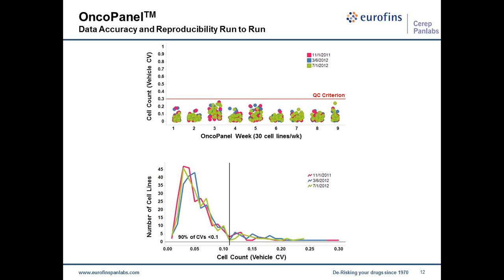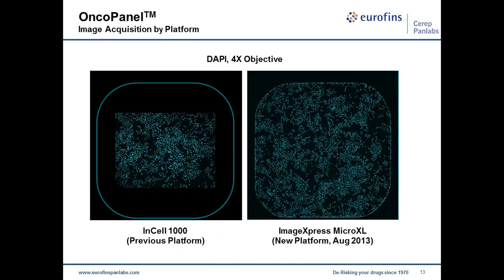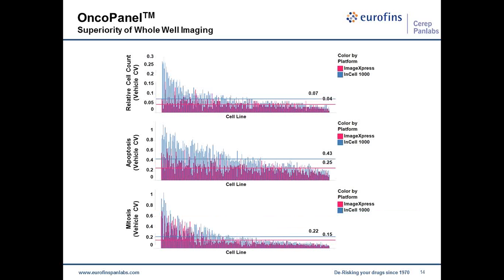And again, this is not as good as the data quality using the current imaging platform, and I'll show you another slide that speaks to that. The newer imaging platform that we've upgraded to takes advantage of a technology that allows whole well imaging at 4x magnification. And because you can visualize more of the well, the data quality is actually significantly improved. And that's illustrated on this slide.